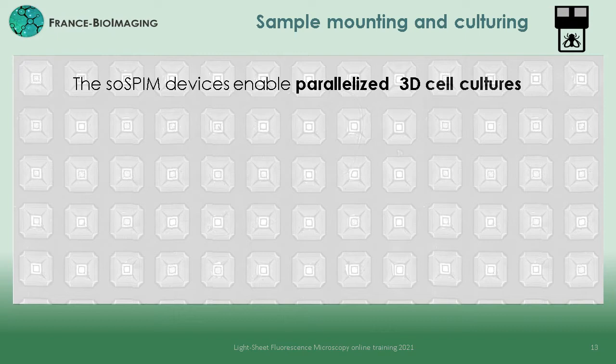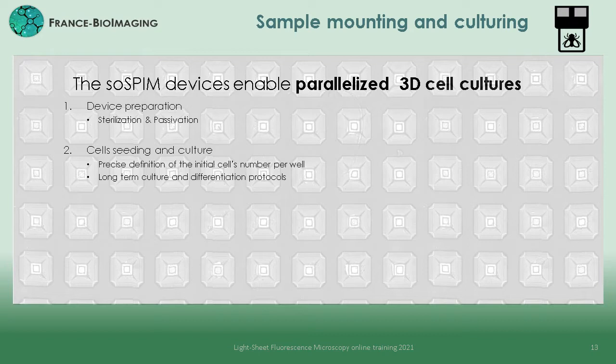First, we will look at the sample preparation and mounting protocol. In particular, we will see that the use of the SOSPIN device enables mounting and culturing hundreds to thousands of samples at the same time into a unique support. We will first go through the SOSPIN device preparation and functionalization protocol. Then we will see how to seed and culture cells of interest into the SOSPIN wells. Even if I will demonstrate this step culturing simple spheroids for clarity, the same principles could be applied to grow organoids as long as the appropriate culture protocol is followed.